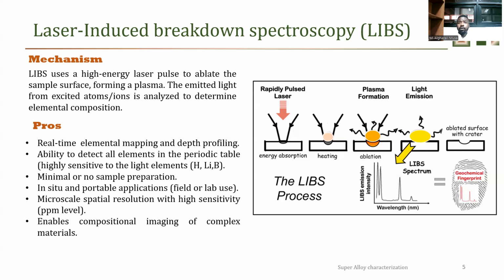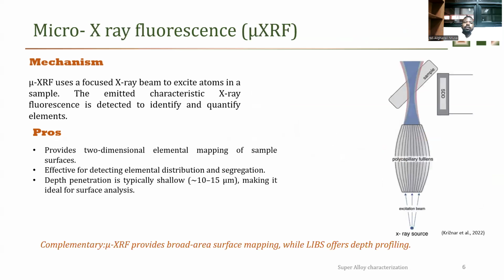Depth profiling is about craters, which we will discuss later. And it also enables compositional imaging of complex materials. So the second device is micro X-ray fluorescence.